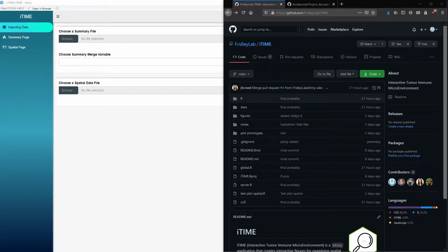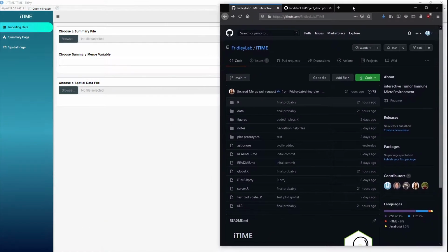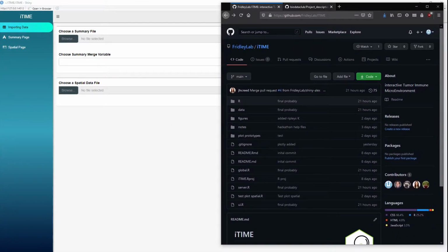Today I'm just going to do a hopefully short video of the project that we were working on for the hackathon. So we just had the institutional hackathon of 2020 between the Biostatistics and Bioinformatics departments. And so I'll share kind of what we had come up with over the day and a half that we had worked on it. On the left-hand side here, you can see that we have that Shiny app, and I just have the GitHub for it open right now.